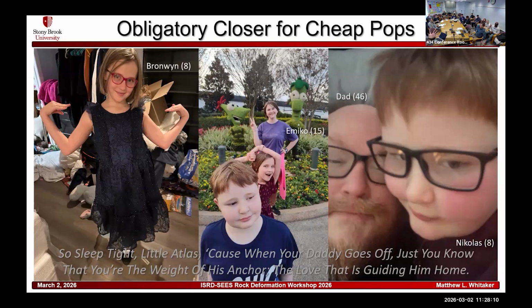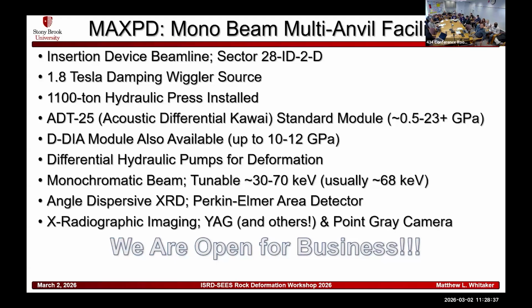So that's pretty much all I wanted to pre-prepare. I don't want to monopolize too many things by talking, but that's the basic difference. I know that Tim was giving some information on how the monochromatic beam works, so I wanted to focus a little bit on the mechanics of the white beam and exactly how we use that differently than the mono beam. So that's it. I also run a beamline at Brookhaven Lab. Okay. Thank you, Matt.